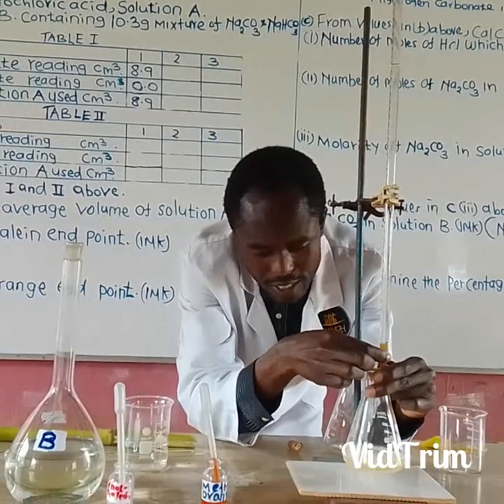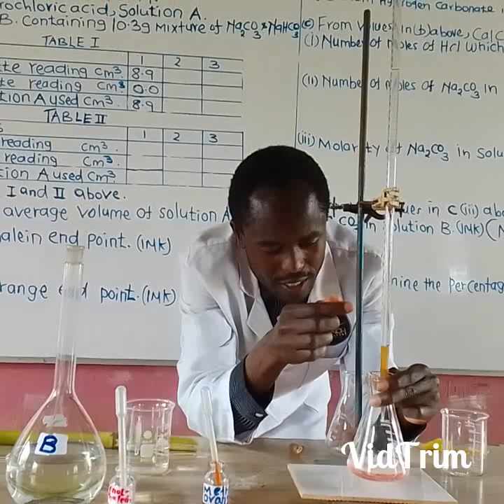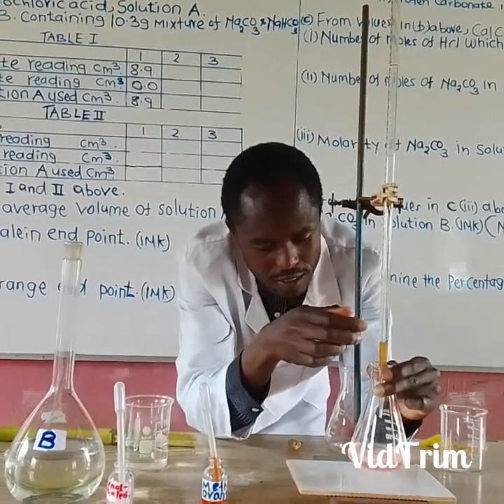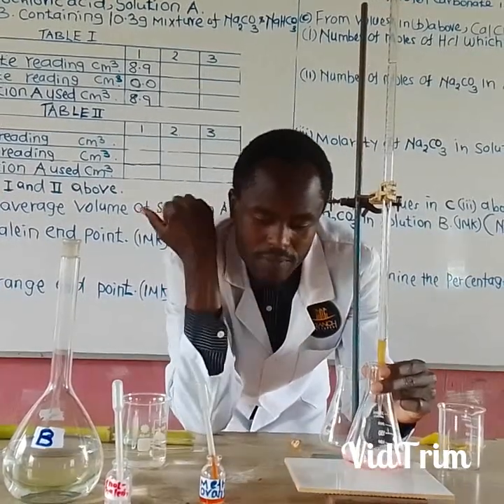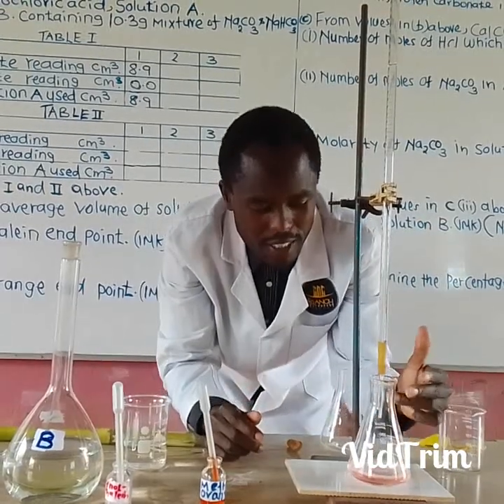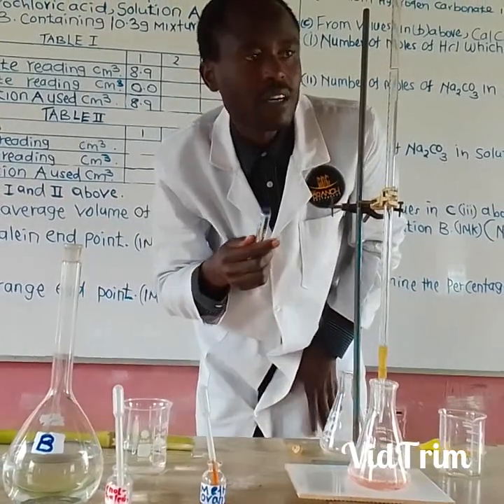The solution is still yellow. Oh, it has just turned immediately to orange. The end point has been reached. Now using methyl orange, the end point has been reached. Then I have now to read on the burette.